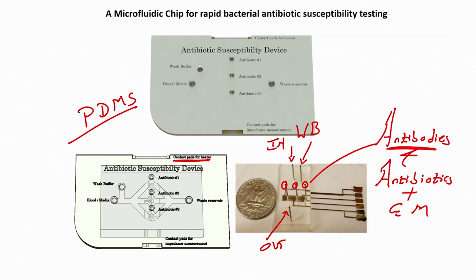First you have to load antibodies, and then you have to go for antibiotics plus growth media.